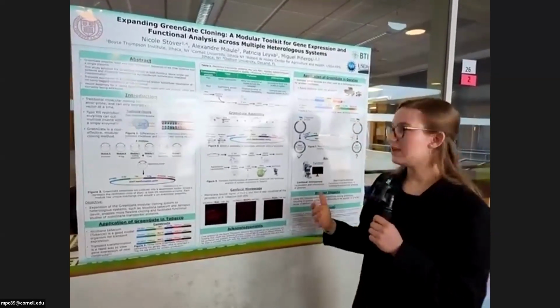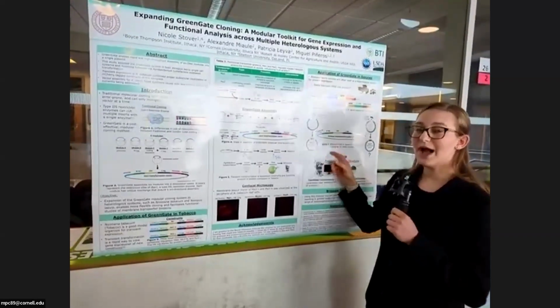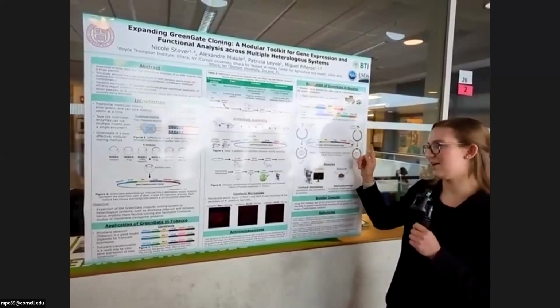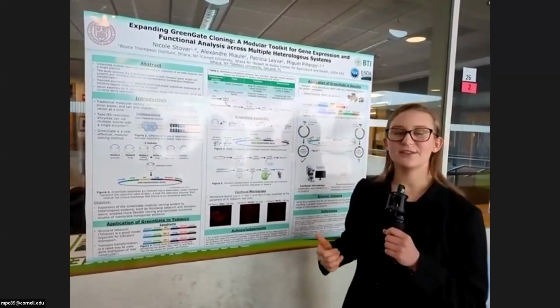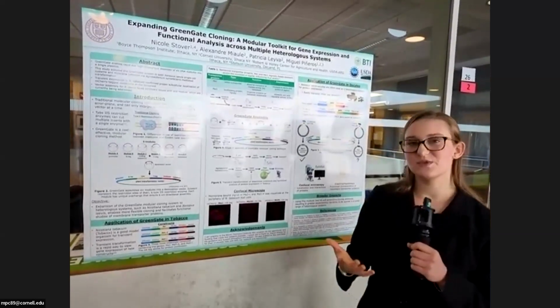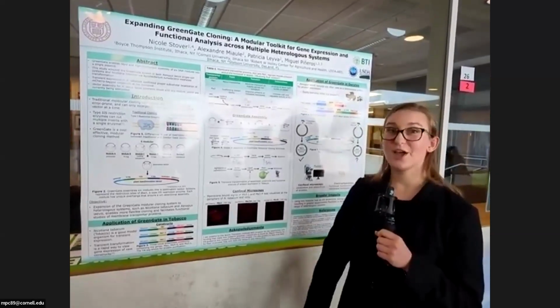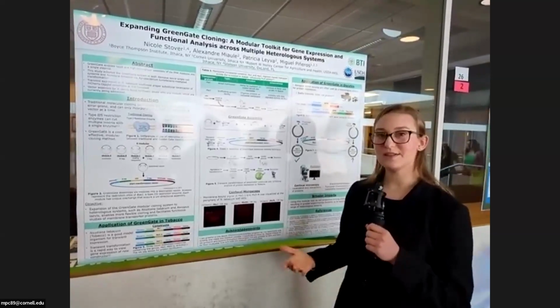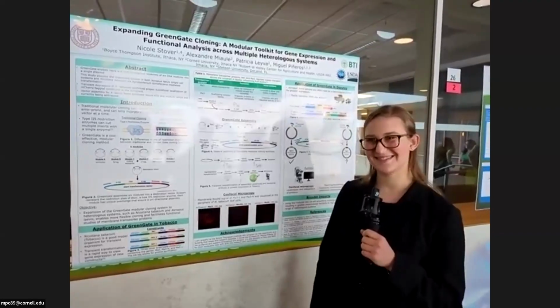We were able to successfully construct the module containing the T7 promoter and 5' UTR, but are actively still working on constructing the module containing the 3' UTR and the poly A tail. Injecting cRNA into oocytes allows us to look at protein localization and at interactions between proteins, as well as additional functional characteristics that cannot be viewed in plants. Using this modular toolkit will allow us to greatly streamline cloning protocols, as well as expanding this technique to a wider variety of heterologous systems.